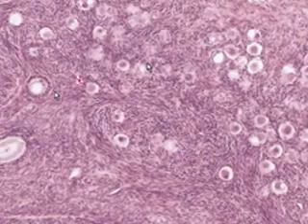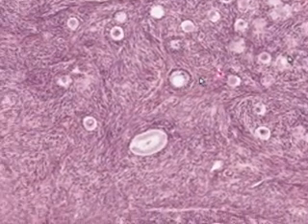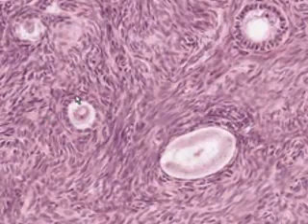When the epithelium surrounding the oocyte has a columnar or cuboidal epithelium, like here and like here, you call those primary follicles.